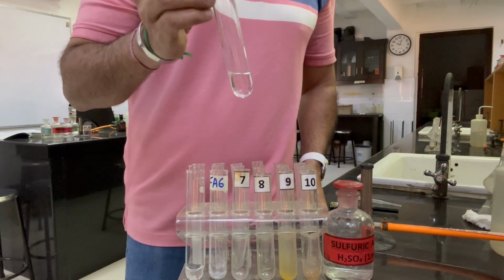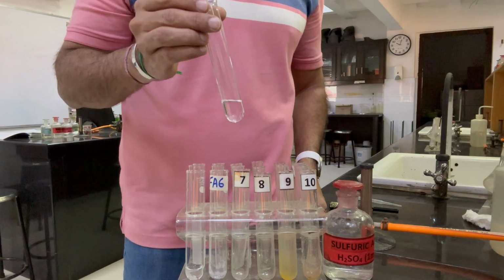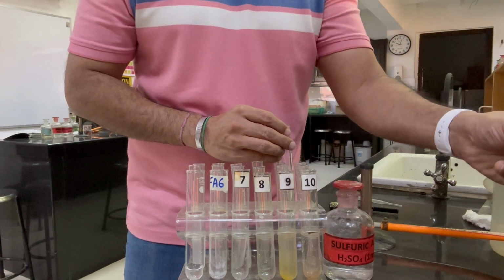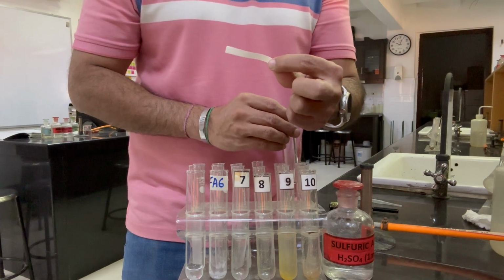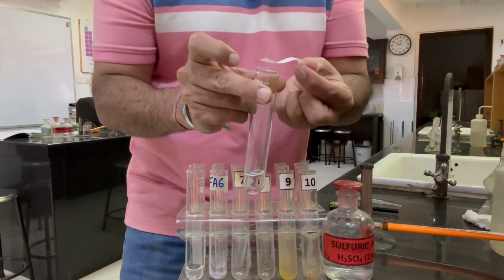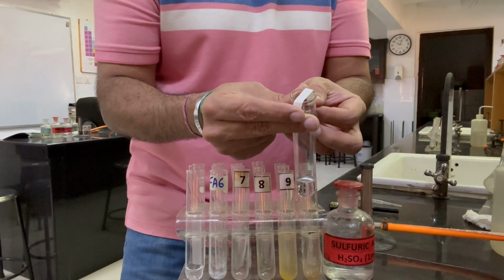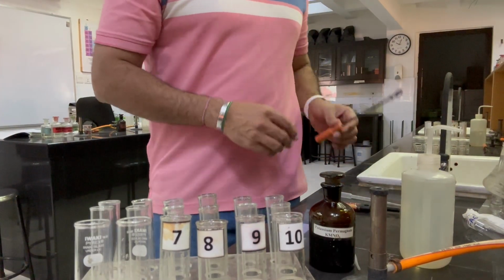So now, how do we test a gas using this liquid potassium manganate? What we normally do is take a filter paper and dip it in potassium manganate so that the solution turns this white paper purple. As soon as the gas is liberated, we put this at the top here, and we will see the exposed part go from purple to decolorized. So let's warm this mixture.